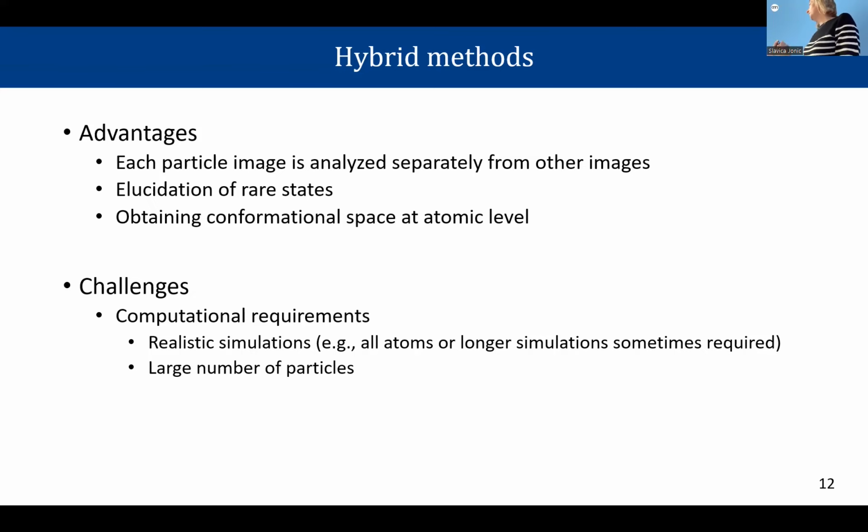Maybe they are convincing, maybe not, but in the cases that we explored, it was working. For example, we will run very short simulations, and the majority of people will say this is too short, like 40 picoseconds. How can you be sure that you are reaching this state in the data?